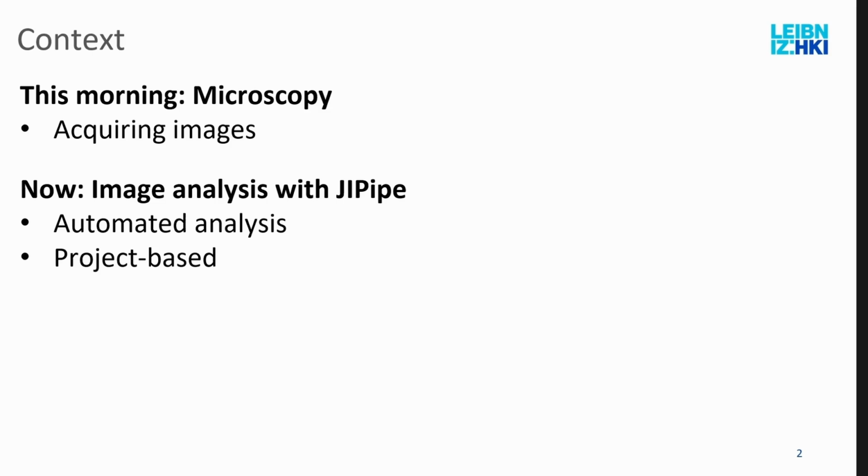So let's begin. As a quick reminder, this morning we had microscopy by Soltan, and now we are handling image analysis, and this will not yet involve anything JIPipe. This will be the basics of image analysis. So you learn the general terminology, and the general techniques that are the same between a lot of image analysis tools. And then later on, tomorrow, there will be the course where you actually use JIPipe.